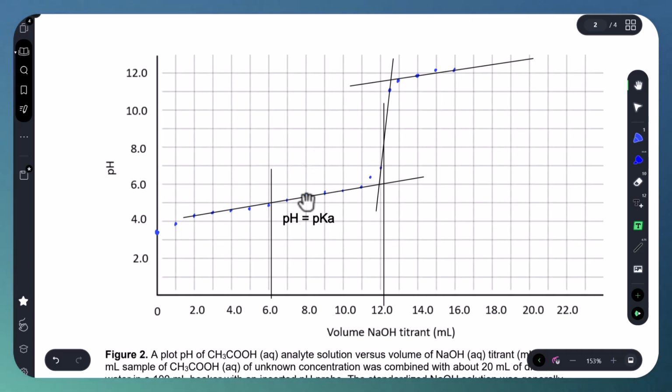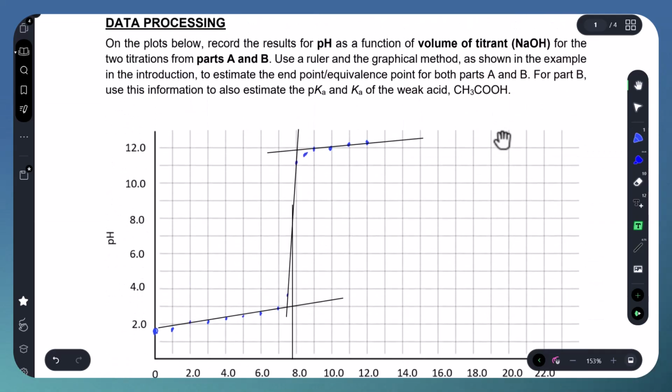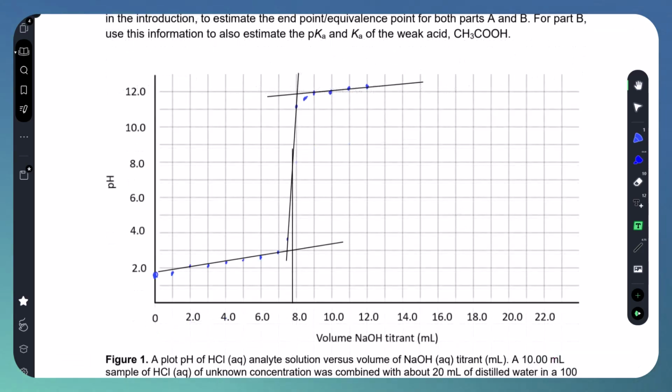Now, there's one last thing that I need to discuss with you. And so what I'm going to do is come back up here. You will see that in one of the questions, you are asked to indicate the pH range for 3 different indicators in Table 1 in the introduction of this lab. Because the idea is we want you to come to understand how you can choose appropriate indicators to follow the course of the titration without having to actually measure the pH.